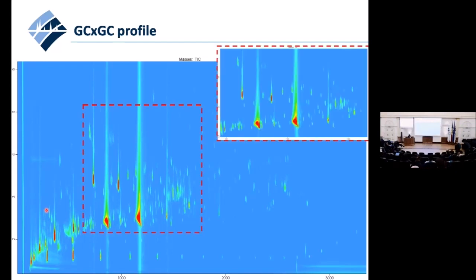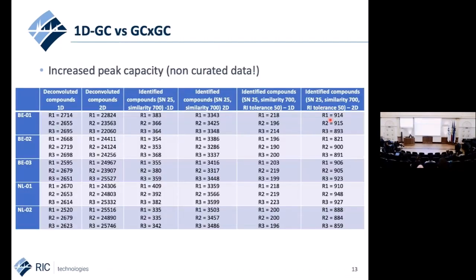When we zoom into a small region here, you will see indeed what I said in my introduction. We have compounds which are present at ppm levels, and that will be these ones here, those ethyl esters there. And we have many other compounds which are mostly present at ppb and ppt levels. But let's look a little bit more into details.